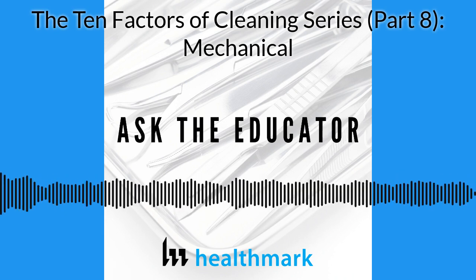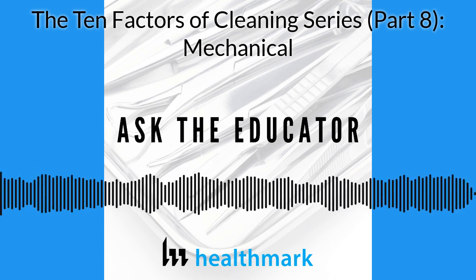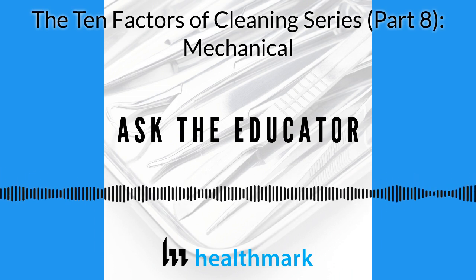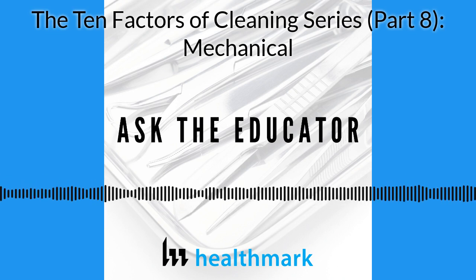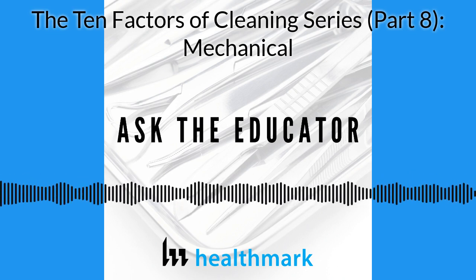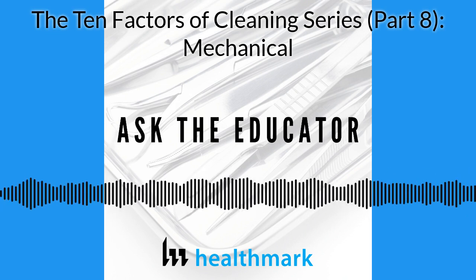And one thing I'd like to expound on a little is that I remember learning from our friend Fred Alston that there are even levels of impingement. You have high impingement or low impingement depending on your washer. These are things that I think it's helpful to know about your equipment to further understand how it works. I think of high impingement like a high pressure washer, squirt gun type of approach. And then you've got low impingement, where it's like you're rinsing it under a waterfall, giving it that high volume, right?